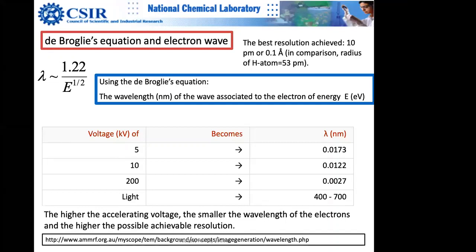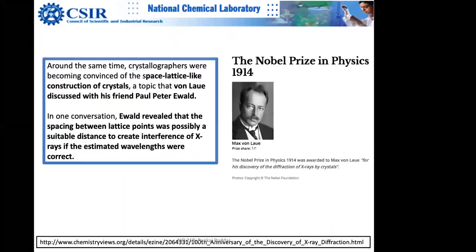That is really critical. Again, the phononic loss is even more subtle, but that's why this became so important in electron energy loss spectroscopy, because it can look at those electrons which have gone through a very small transfer of energy, and that carries a lot of information about the matter. So one has to be very careful with the machine, how to use it.